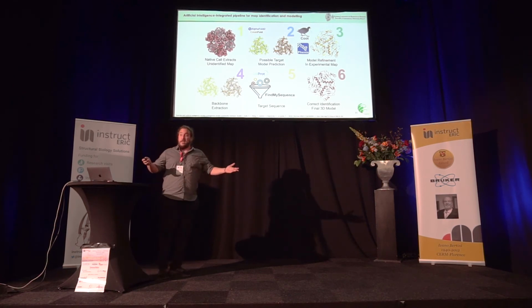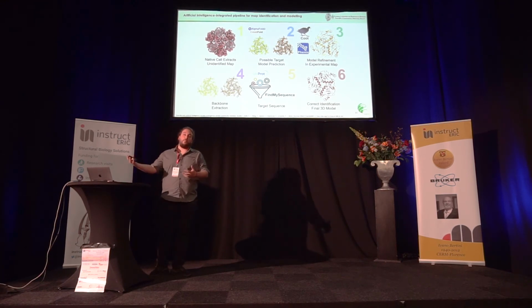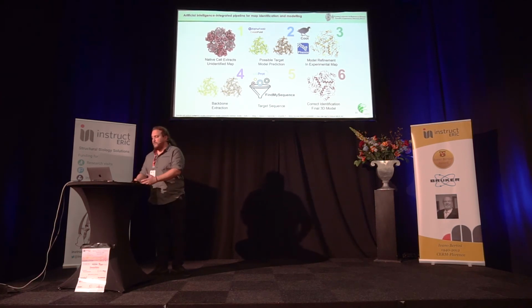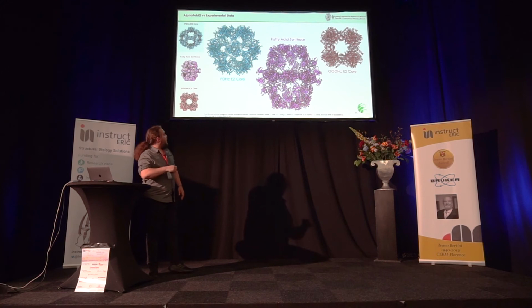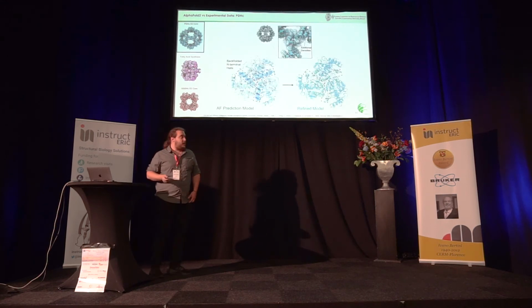So we're done with identification, and now we can gain some very interesting insights into how AlphaFold predicted models can differ from models that have been refined in our maps. The insights concern the oxoglutarate dehydrogenase complex, the fatty acid synthase, and the pyruvate dehydrogenase complex E2 core. We'll start with the pyruvate dehydrogenase complex.